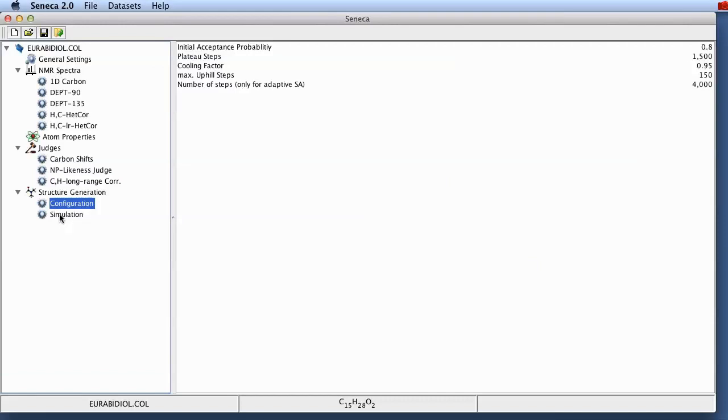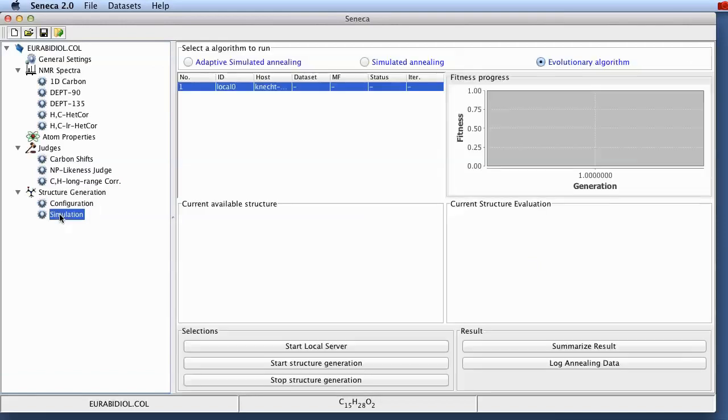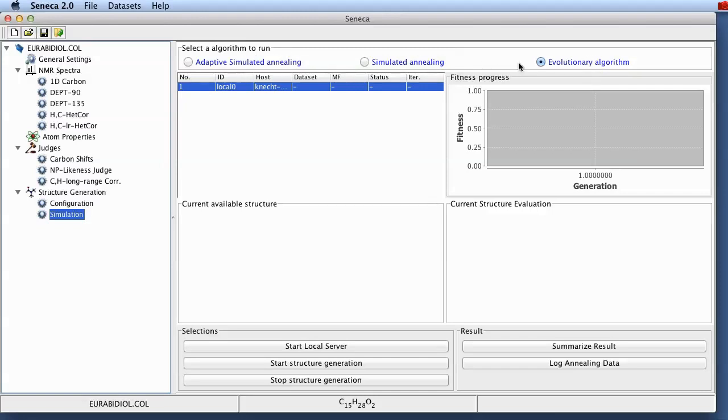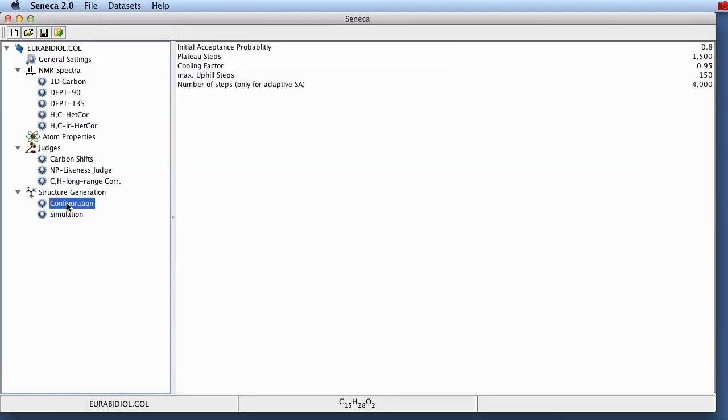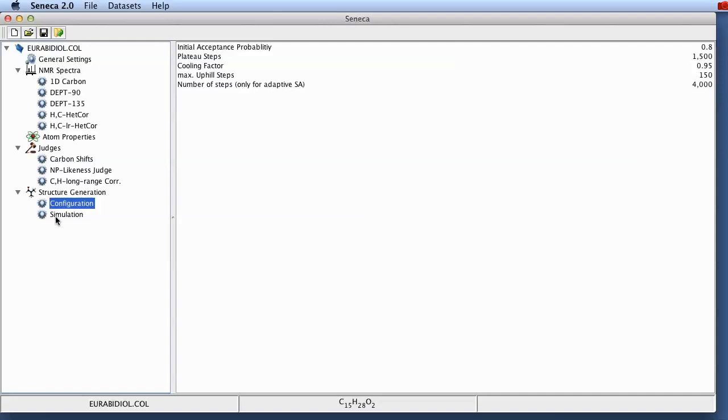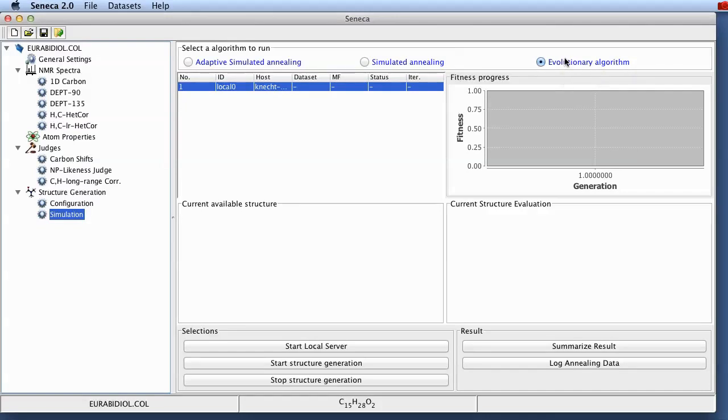So this has already been automatically configured and we can now go through all the way down to the simulation pane where you've got the different methods for doing Seneca structure elucidations. We've got adaptive simulated annealing, simulated annealing, and the evolutionary algorithm. Those different algorithms can be configured in the configuration pane. The nice thing is that for the evolutionary algorithm you don't need to configure anything. Which is why we are only going to look at this at the moment.